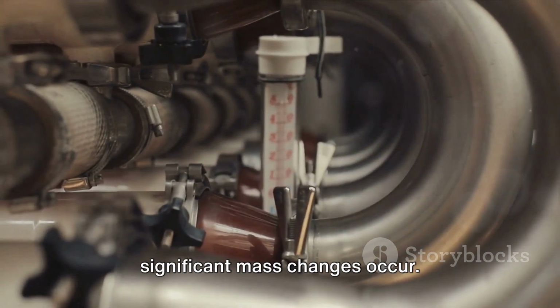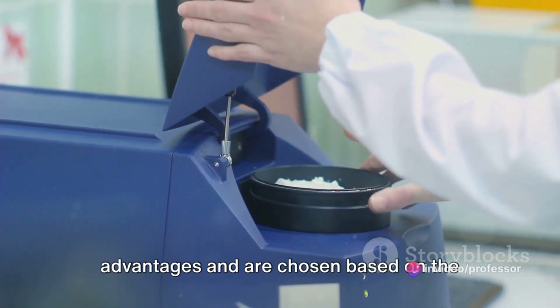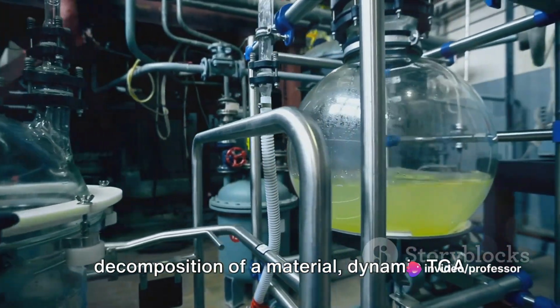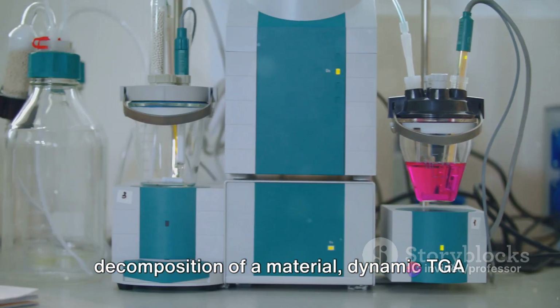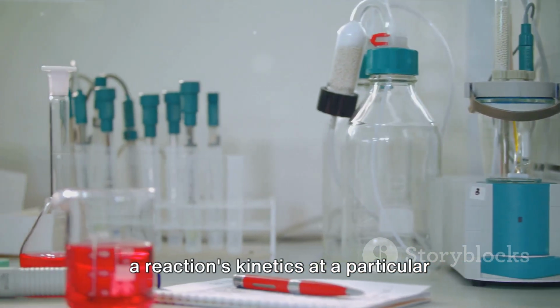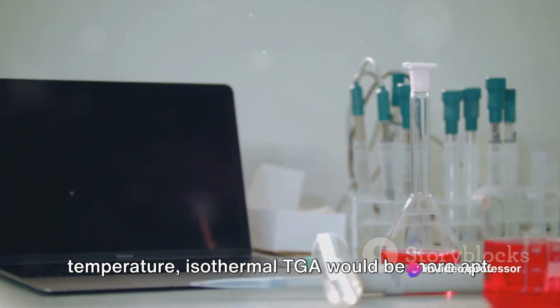Both these types of TGA have their own advantages and are chosen based on the nature of the investigation. For instance, if you want to study the decomposition of a material, dynamic TGA would be your go-to. But if you're interested in understanding a reaction's kinetics at a particular temperature, isothermal TGA would be more appropriate.